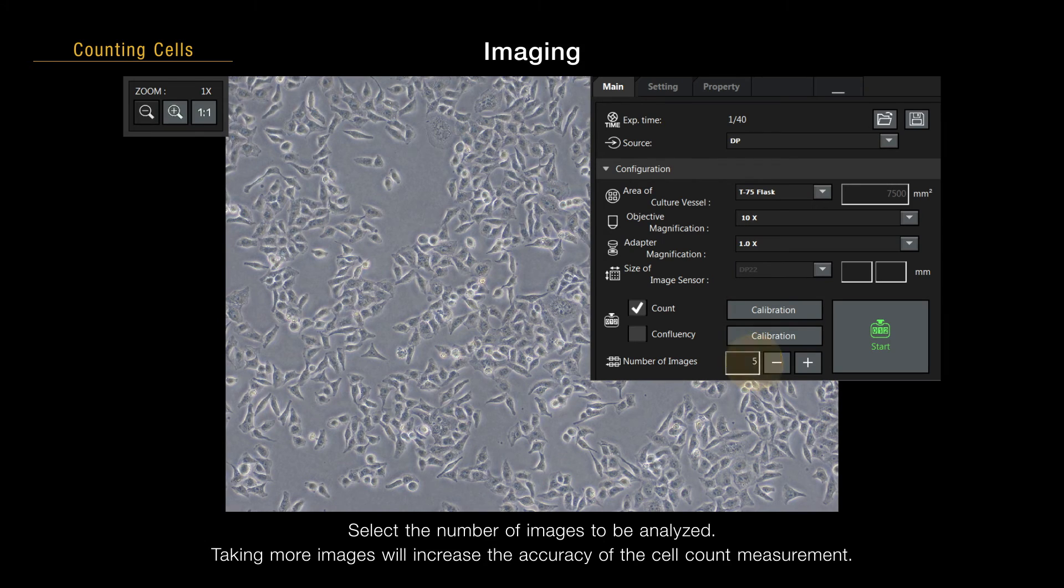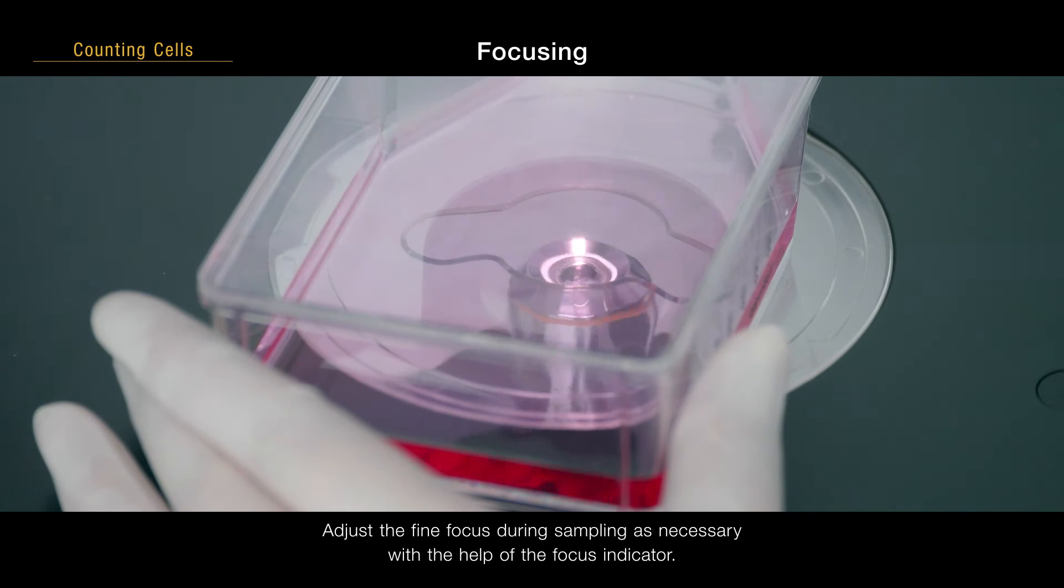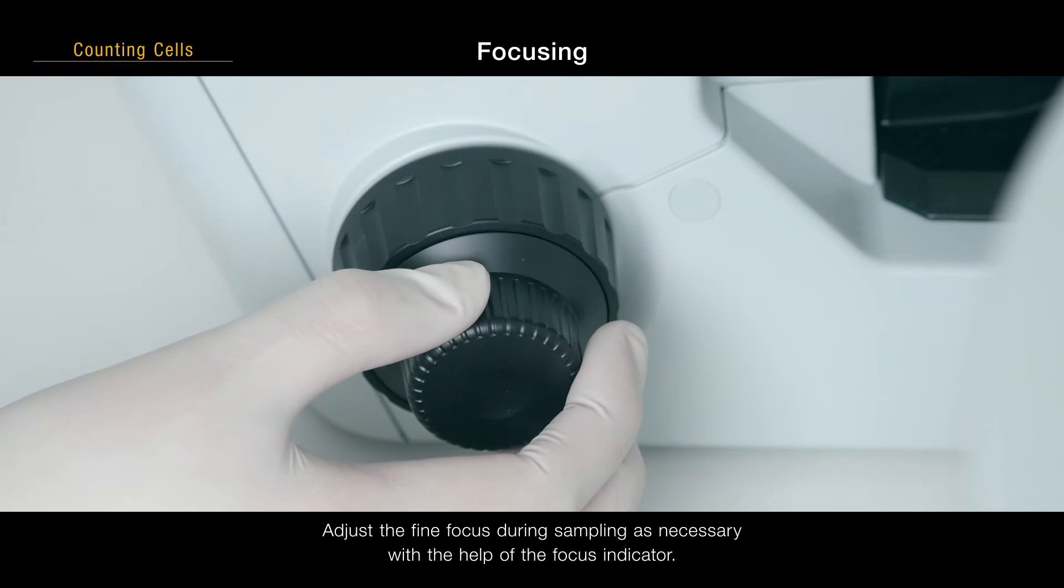Select the number of images to be analyzed. Taking more images will increase the accuracy of the cell count measurement. Adjust the fine focus during sampling as necessary with the help of the focus indicator.